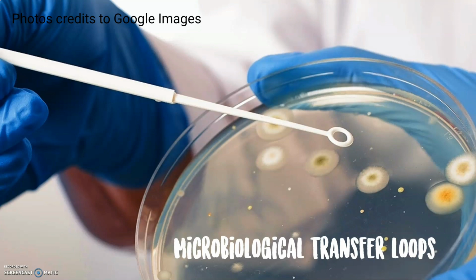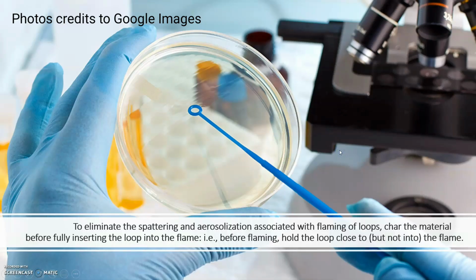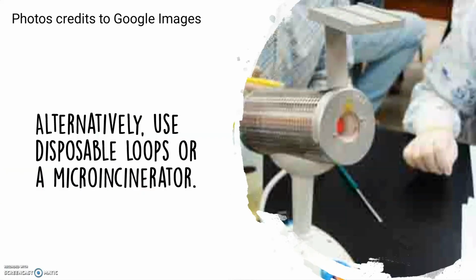For microbiological transfer loops, this is used in aseptic technique, as you can remember. To eliminate the spattering and aerosolization associated with flaming of loops, char the material before fully inserting the loop into the flame. For example, before flaming, hold the loop close to but not into the flame. Alternatively, use disposable loops or a micro incinerator.